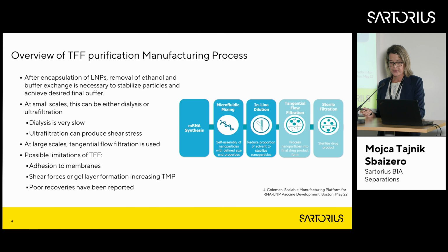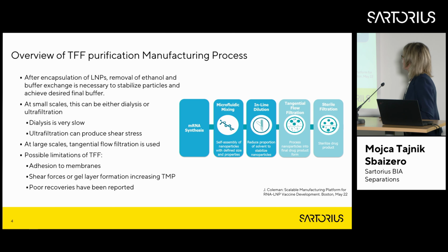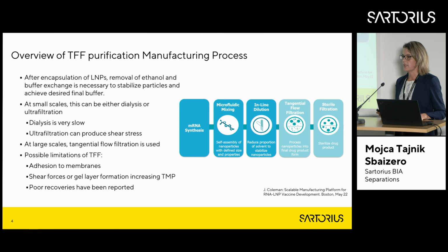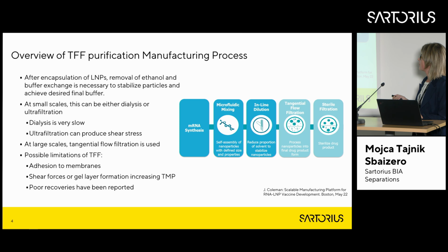So currently, the process that was also used during the pandemic and so on is the TFF purification. For the downstream scientists, this is a very simple purification workflow. You have the synthesis of the LNPs by microfluidic mixing, then dilution, tangential flow filtration, and sterile filtration.